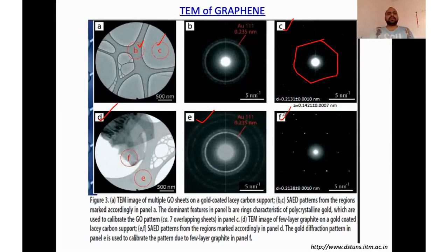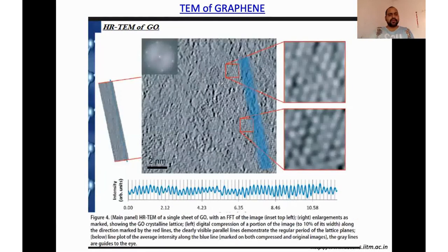So though graphene is there, with a clear hexagon format, it has some crystal defects. So we can say by HRTEM analysis, we can get the atomic arrangement, and we can also get an idea about what kind of defects are associated here, right?